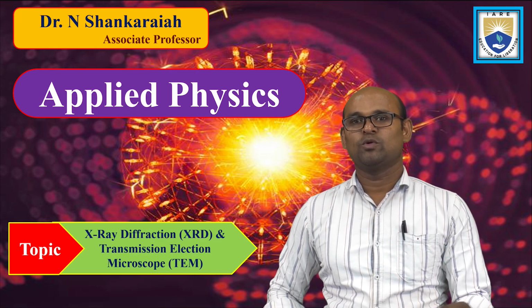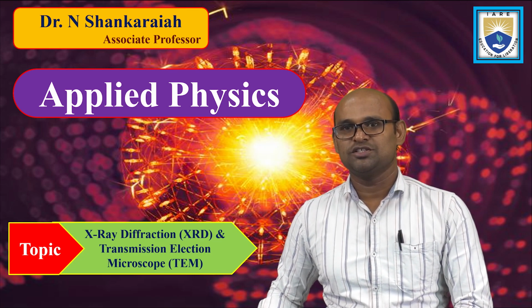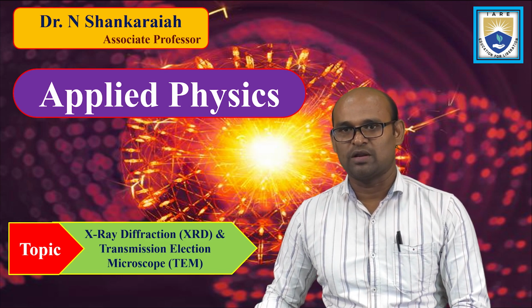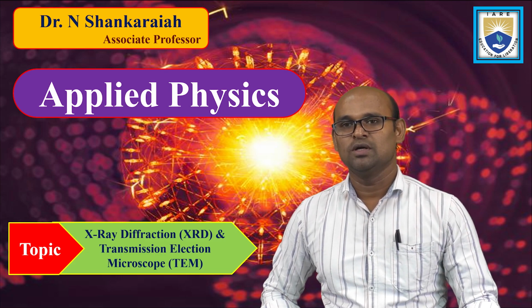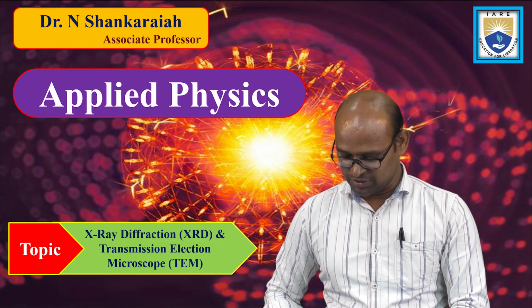In this presentation, I am going to discuss characterization techniques from Module 5, Nanotechnology. Two characterization techniques I am going to discuss are X-ray diffraction and transmission electron microscopy.